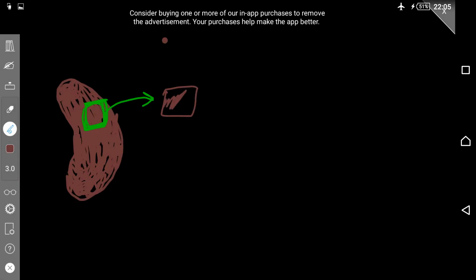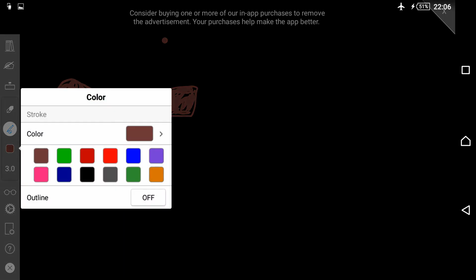Now this tissue, as said before, is thick and non-translucent, so we have to make this particular tissue prepared and ready to be examined through a microscope.